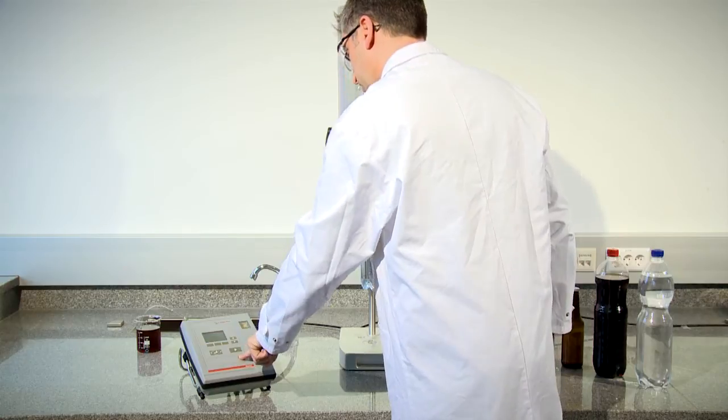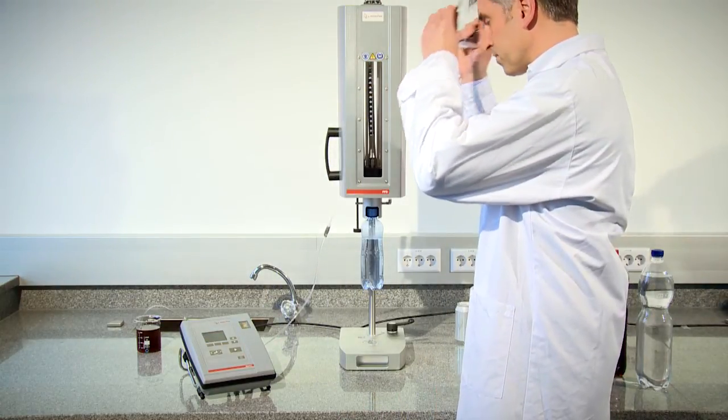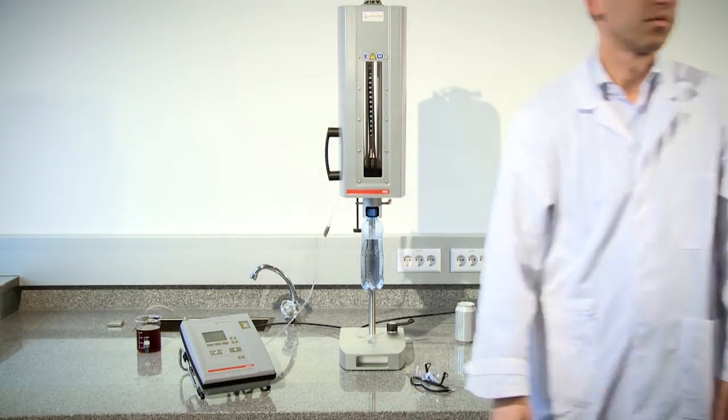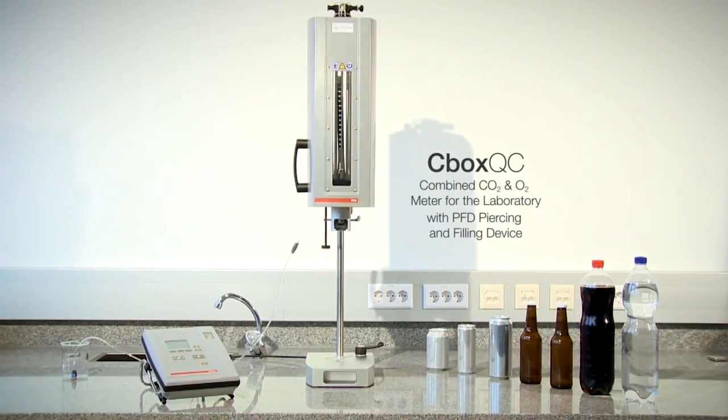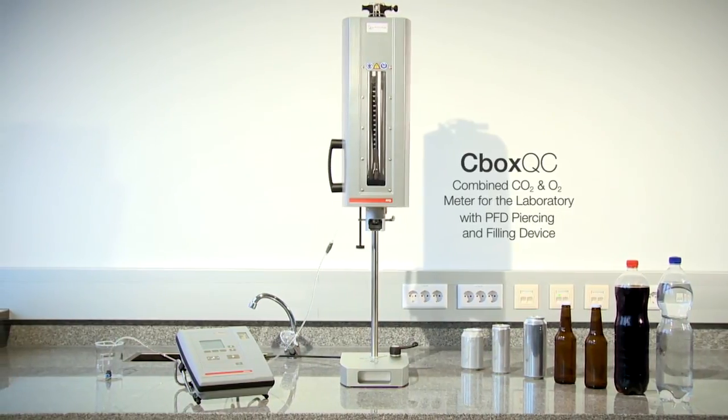And switch off CBOX QC. You can leave your lab knowing that you went straight to the heart of your task instead of taking the long way around. CBOX QC. The fast, simple, reliable choice for CO2 and O2 determination.